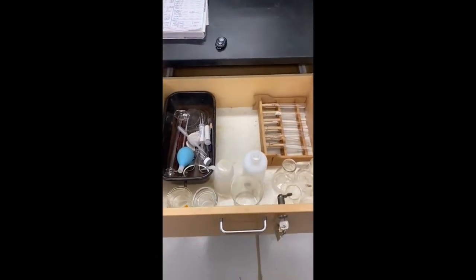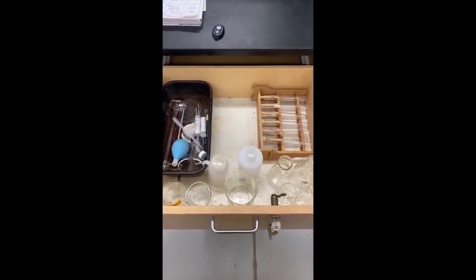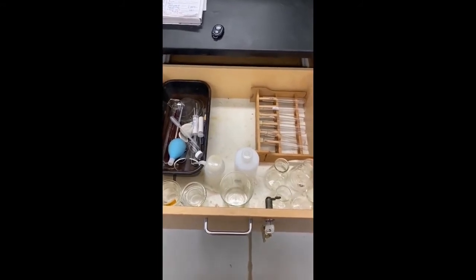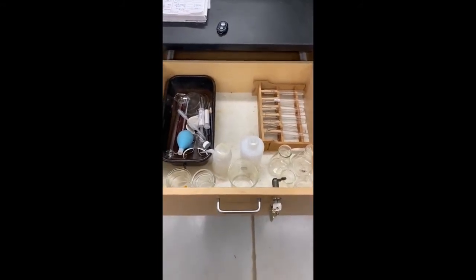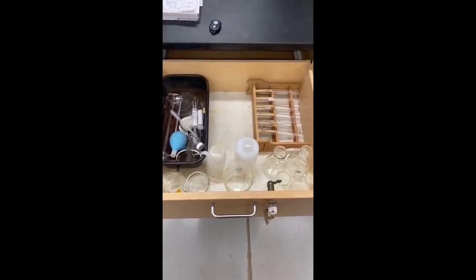All the drawers are stocked with all the equipment that you'll need for this semester, other than common equipment which we put out for each individual experiment. This is your equipment, and you should make sure that you take care of it, that you don't break it, you don't lose it, you don't leave it out on the bench top, and that you keep it clean in between weeks. You can also lock your safety goggles and your face shield in your locker from 1 week to the next, since nobody else has the key to your locker.